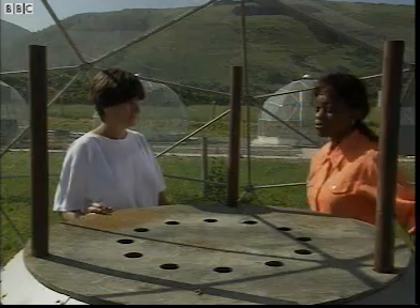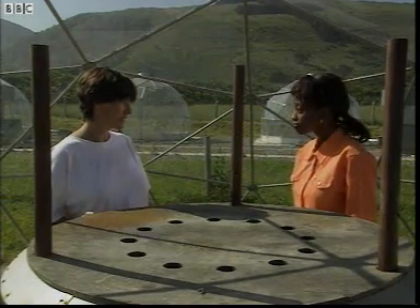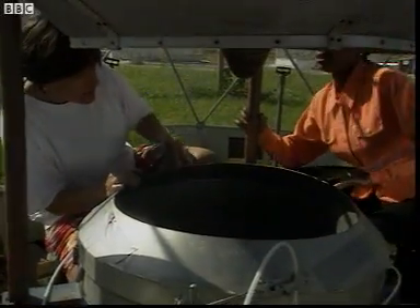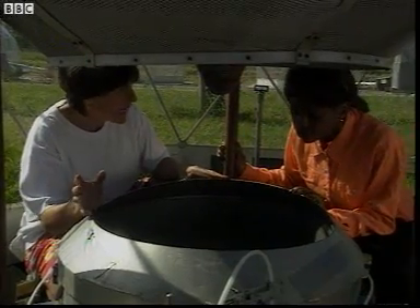So what's special about this dome? It feels just like outside. Well, the temperature is exactly the same as outside, but what's different is the carbon dioxide levels are actually double outside. Really, I can't tell the difference — I can't see it or feel it. But this is what all this equipment here is for: we're actually taking carbon dioxide from the tanker, blowing it through this hole and spreading it over the plants in each dome.